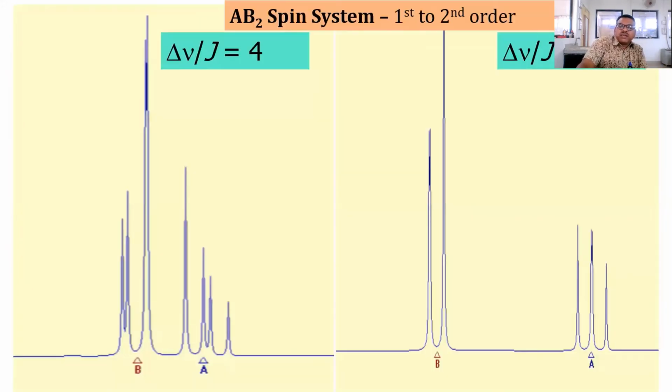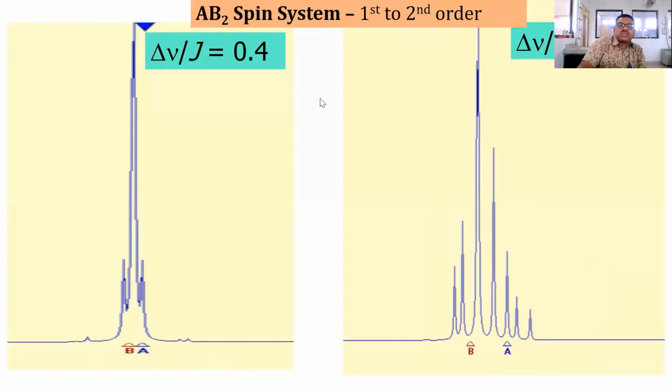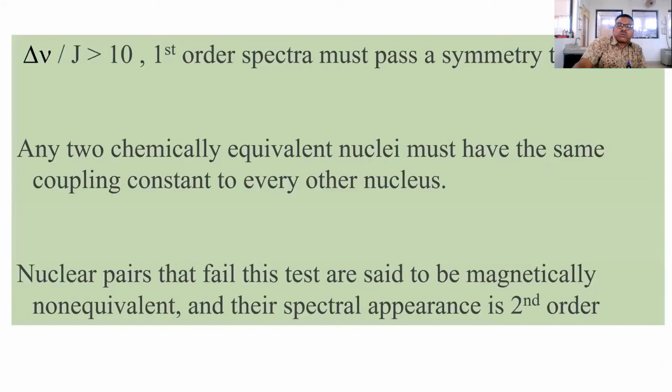if I take the two parts of it, if I divide this section, I can get two equal parts. Therefore, it is giving a first order spectra. So again, this is the characteristic property of the first order spectra. You are getting the symmetry at the midpoint of the peak.